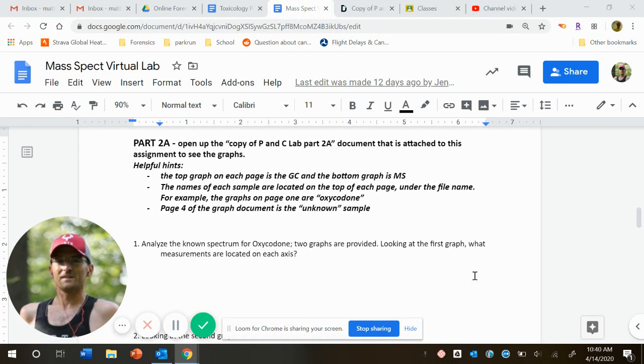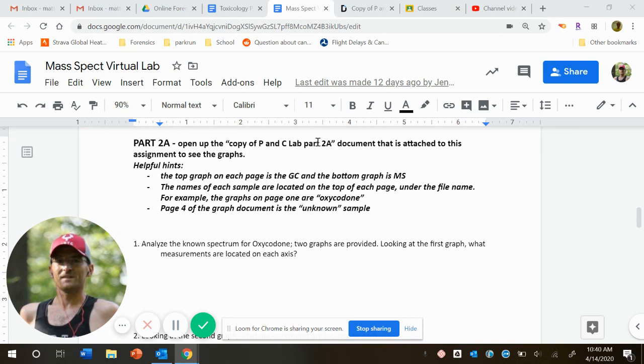In part two, we're actually going to take a look at a gas chromatogram and a mass spectrometer, or I really should say a mass spectrum.